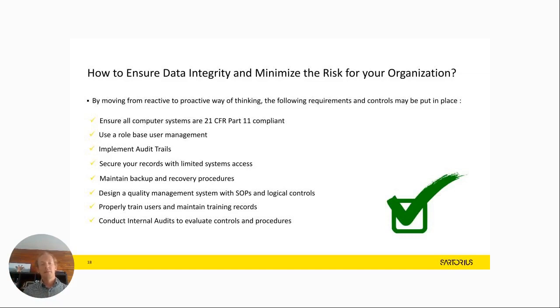Yeah, no. Yes, it is. If you set up all the features, then it is the only lab weighing instrument which is fully standalone compliant without any additional software. If you don't set them up, it's not compliant. So it's always that game.